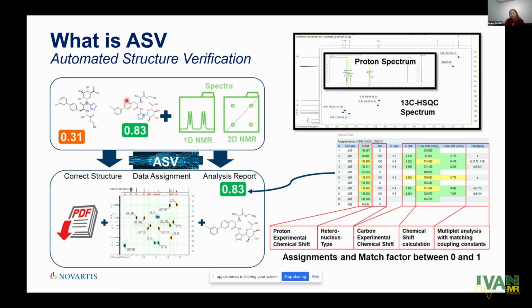Only 1 molecule will be tested if the chemist says exactly P1 of this reaction needs to be tested. But if you put in the ELN without P1 and without P2, every structure after the arrow will be tested. So here we were able to retrieve 2 structures.